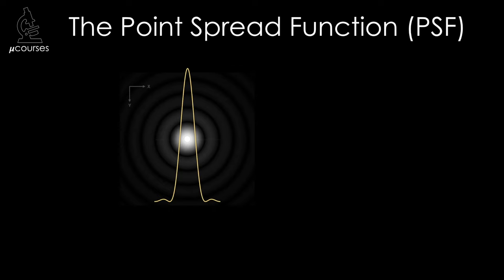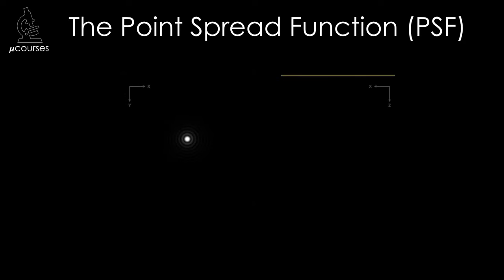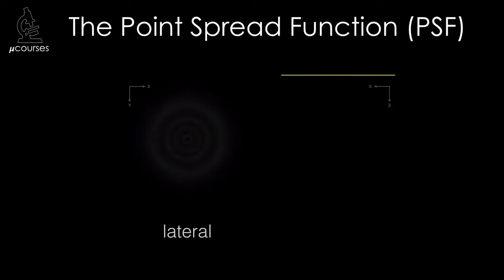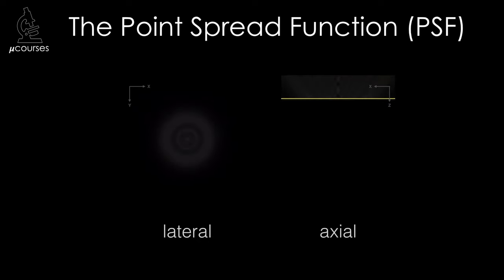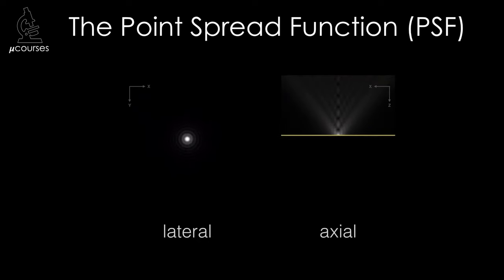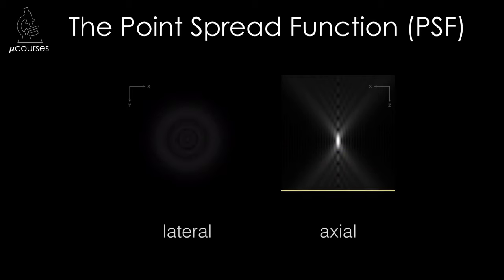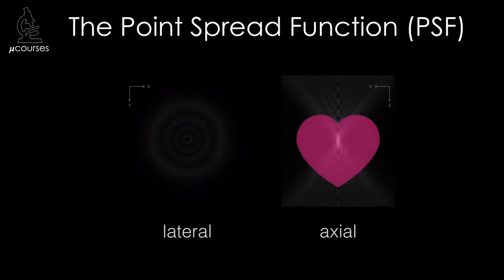We also see that the bead resides in the center of that Gaussian. This xy image of the point spread function is referred to as the Airy disk. The point spread function is three-dimensional, so I'm going to decrease the magnification of the bead so we have a larger field of view. Now we're going to focus up and you'll see that the outer rings are outside of the focal plane as well, and they get larger as we go out of focus. If we collect a z-series of the bead and build up an orthogonal three-dimensional reconstruction of the axial image of the bead, you can see that the point spread function is beautiful.